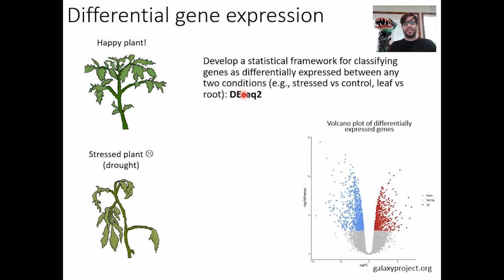And then we essentially get this plot of differentially expressed genes. Here they're plotted by their log fold change, where these genes would be lower expressed in one sample, maybe these would have less expression in happy plants, and then these genes would have more expression in the happy plants compared to stress. Then genes down here, this is the log p-value, so these would be not significantly differentially expressed, and these genes that are in blue or in red would be considered differentially expressed.